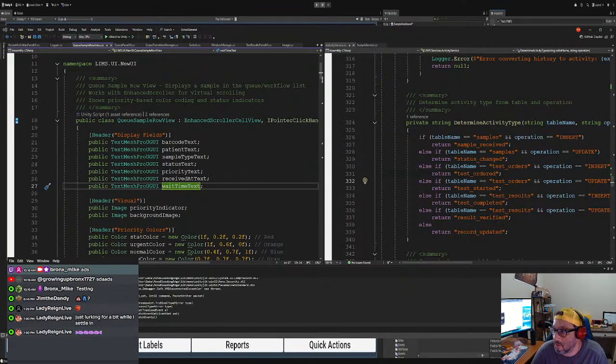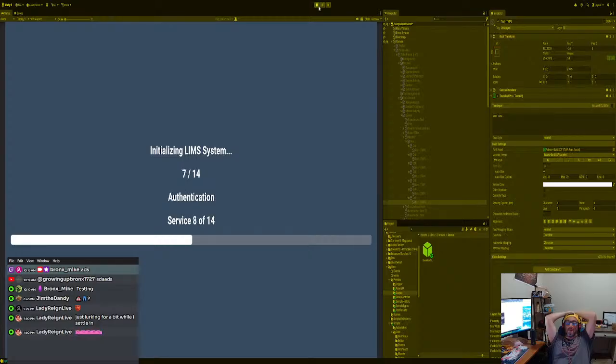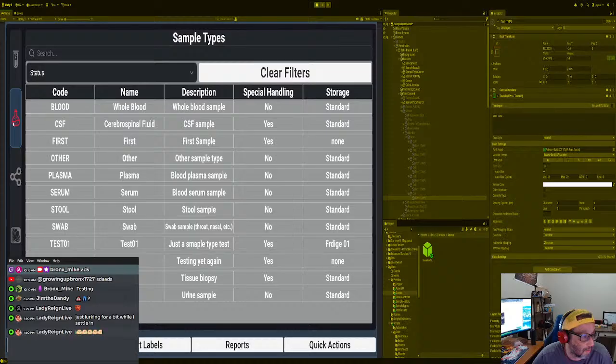All right. So we fixed the headers, designations, and that should be it. Like I said, you should actually make this dynamic. Create the columns with the names on it, and then yeah, it'll make more sense instead of us doing it by hand all the time.